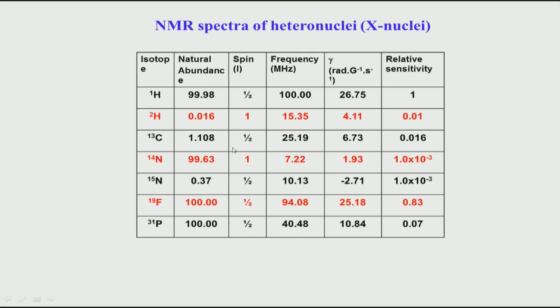So, let us look at how proton carbon 2D experiments can be done and how we can improve the sensitivity of carbon, so that the spectrum can be recorded in a reasonable amount of time. So, these are basically the three problems which do not favor many nuclei. One of the most important two factors, as we saw, is gamma value and natural abundance. If natural abundance is low, then sensitivity is less, and if gamma is low, the sensitivity is also low. So, compared to proton, these are the factors which make it less sensitive for X nuclei.